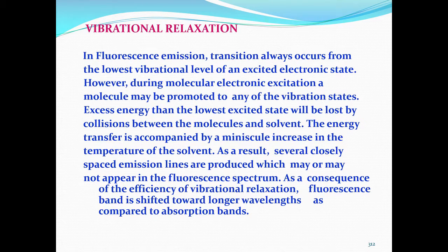The energy transfer is obviously accompanied by a minuscule increase in the temperature of the solvent, and this phenomenon is also observed in spectrophotometry. There also the absorbed energy is released as heat, but the energy is so small that it almost goes unnoticed.